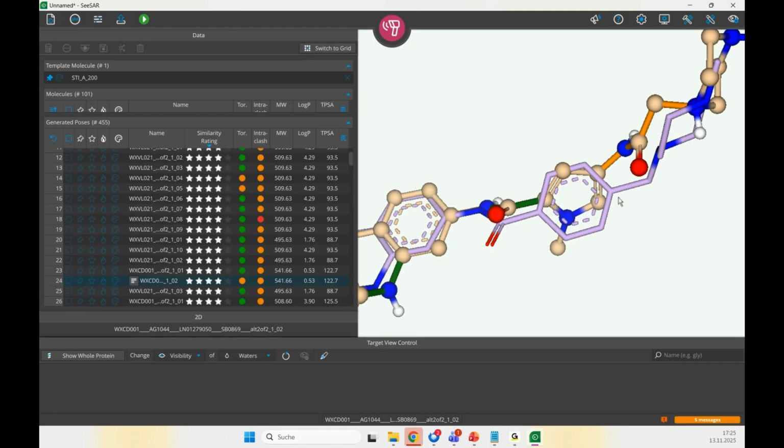And then working with the SD file, running some Python scripts, you can also reach out to me. I have a Python script for that, to mine for the best aligned candidate for each individual candidate of those compounds as well. So what is the similarity scanner used for?